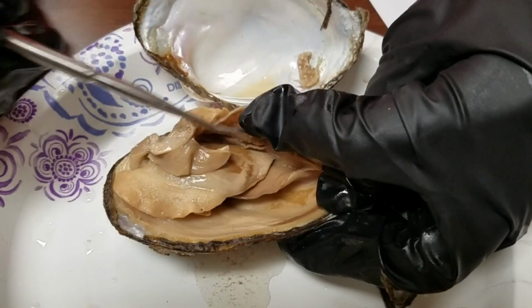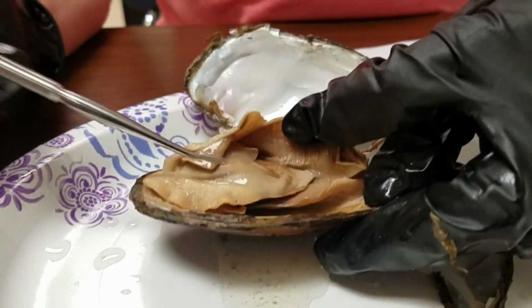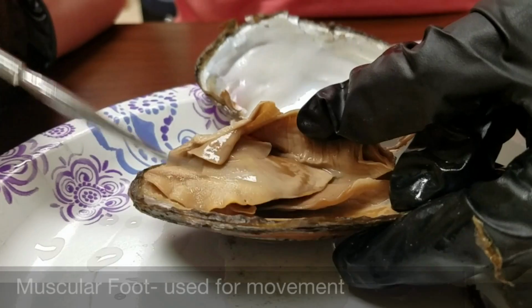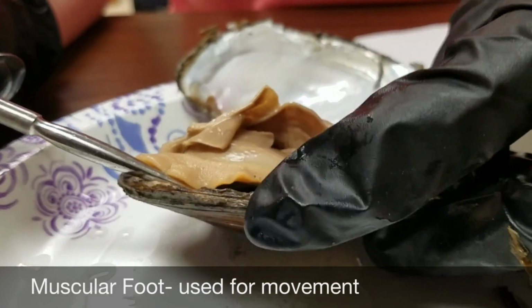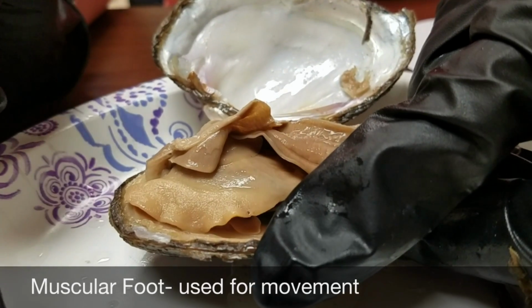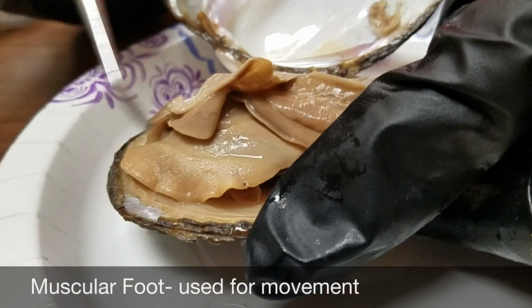And then if you look under the gills, and you touch this thing, this is the muscular foot, and it's really solid. It's very firm. So the muscular foot, they're going to stick it out of the shell, and they're going to use it to move along, pull themselves along. So they'll stick their foot out and pull themselves along.